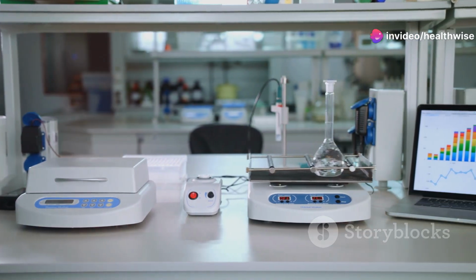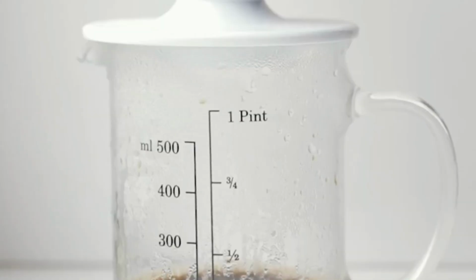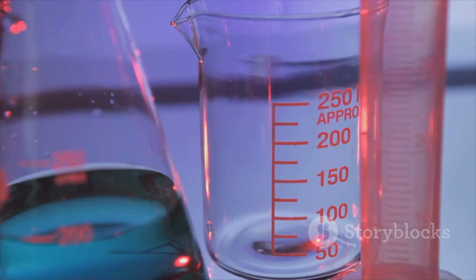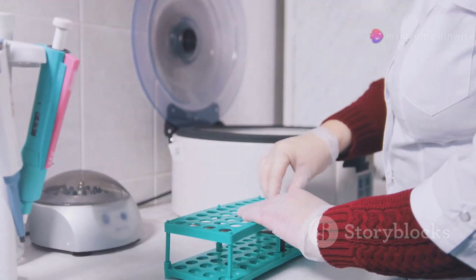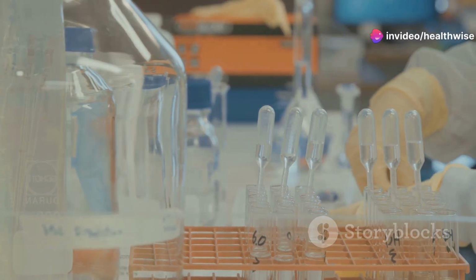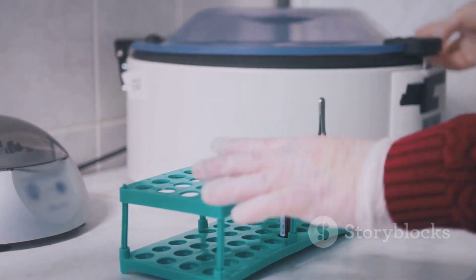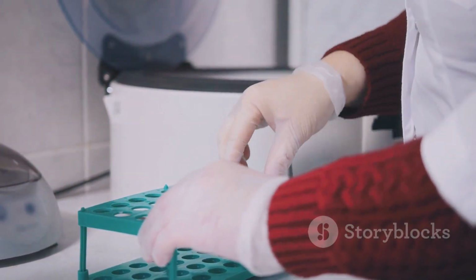Now let's talk about the main types of chromatography. First up, column chromatography. Here, the liquid passes through particles of solid packed in a tube. It's like pouring a liquid through a filter, but with much more precision. Next, we have thin layer chromatography, or TLC. This method is simple, rapid, and quite powerful for separating organic compounds.